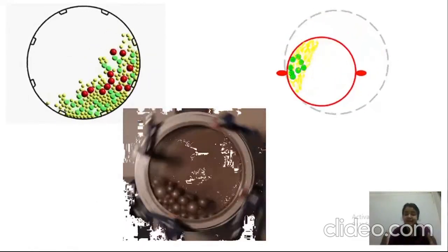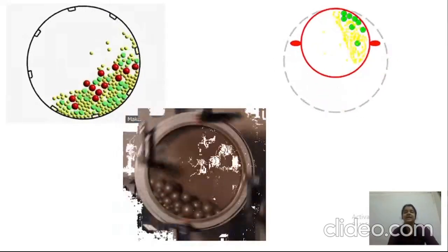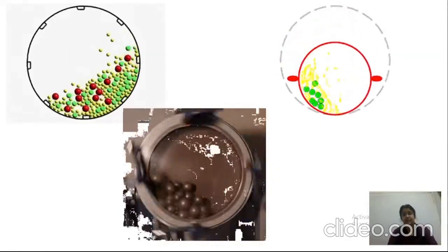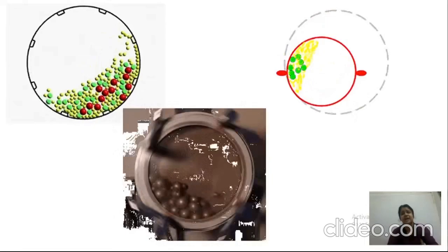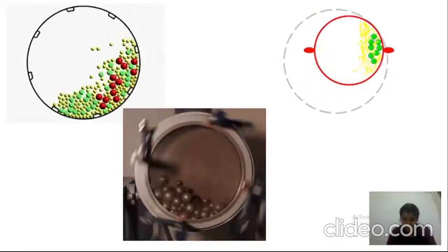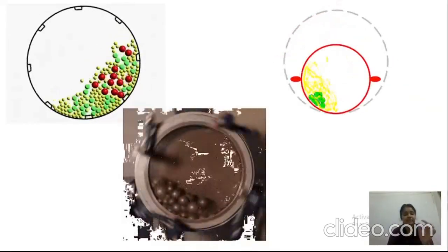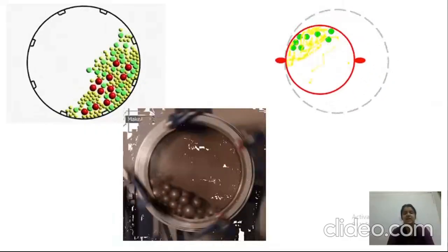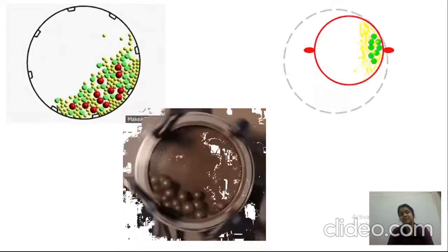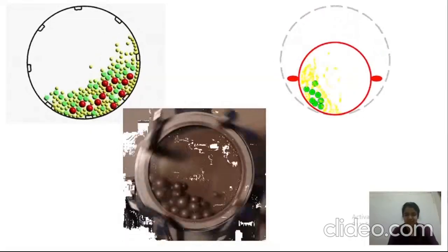Without using any expensive chemical, we can synthesize any types of nanocomposite or nanocompound in a very short interval of time. If we use various types of chemical method, then we have to use several types of lengthy steps, and we have to use several types of expensive chemicals. But in this process, we only use the precursor powder, and within a very short time interval, within 3 to 4 hours, we can synthesize this type of nanocomposites or nanocompounds without using any other expensive chemicals. That's why it is a very simple, facile and cost-effective method for the synthesis of several nanocomposites.